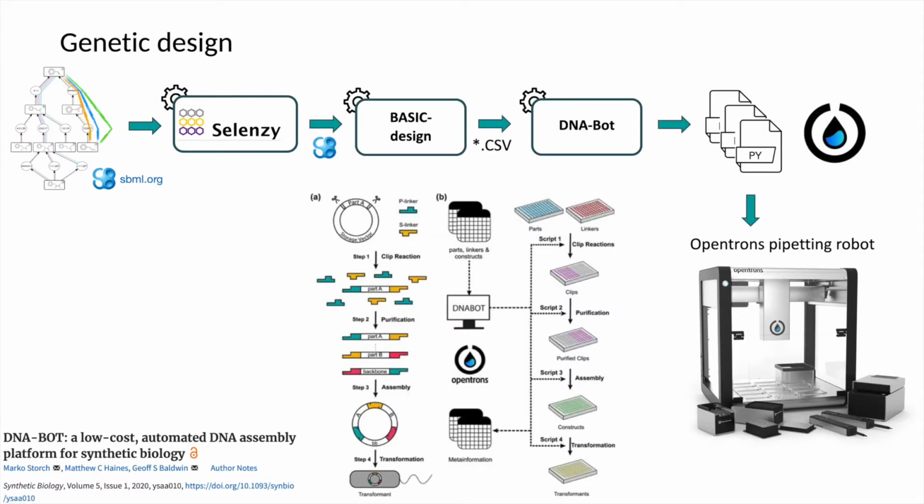Briefly, the workflow execution is as follows. From the reactions described in the SBML pathway, the Selenzyme node searches for enzymes within the UniProt database for each reaction. The BASIC design tool converts the SBML file into a set of CSV files listing the DNA parts to be included and enumerates possible combinations of promoters, RBSs, and enzymes into constructs.